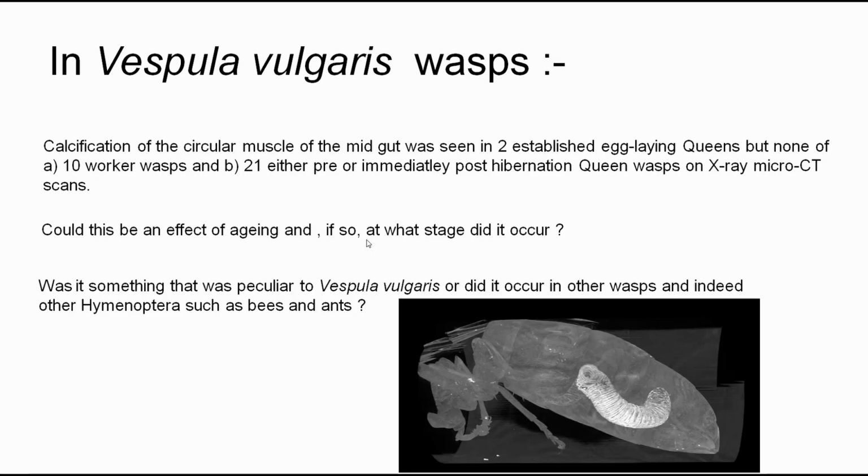So, by way of background, we had found this appearance in only 2 of some 33 vulgaris wasps, and we were interested in trying to find out whether it was an effect of aging, and also to look at a few other wasps and bees and ants, in other words the Hymenoptera, to see whether this occurred in others.